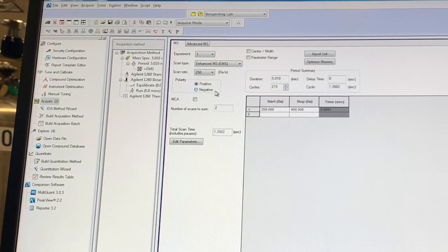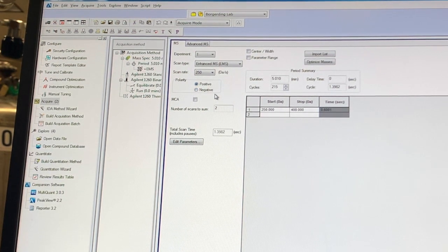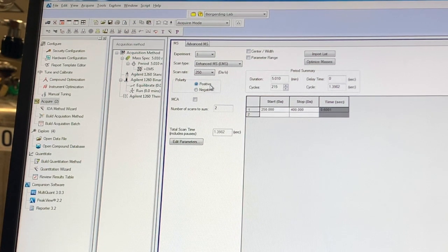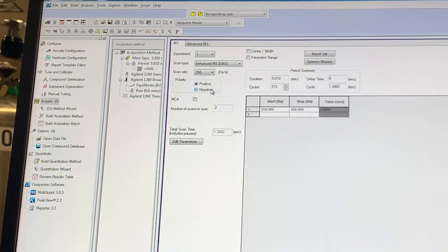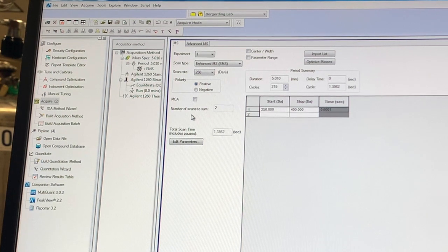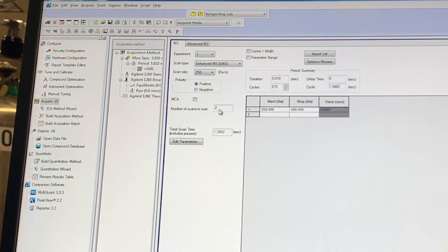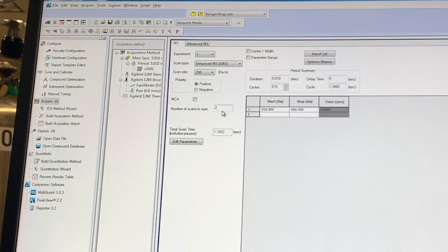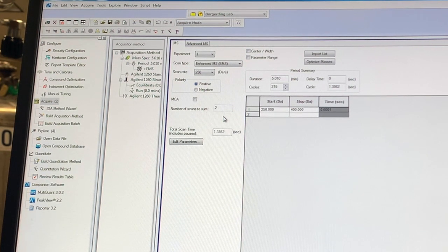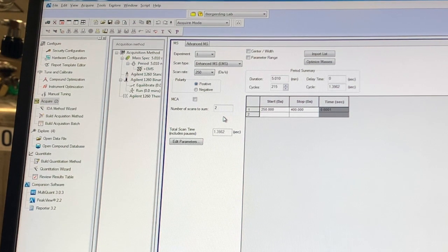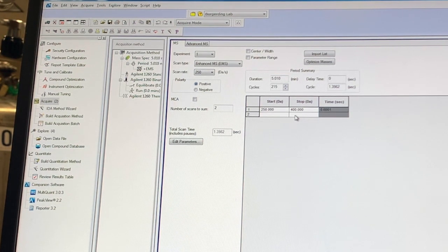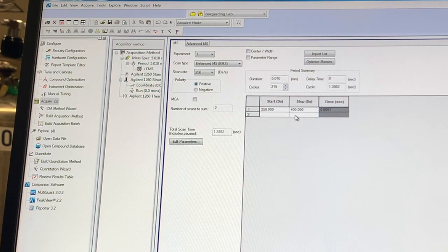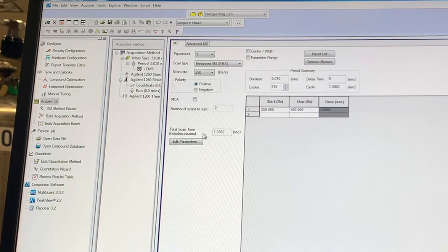Now there are, of course, two different polarities we can designate in this EMS mode, positive ion mode and negative ion mode. And now we'll just tell the detector whether we are detecting the positive or negative ions. Another parameter that we can change here is the number of scans to sum. And that can be really useful if perhaps your analyte isn't eluting sharply and you want to sum multiple scans over this range. And that will kind of magnify the height of your chromatographic peaks from the baseline.